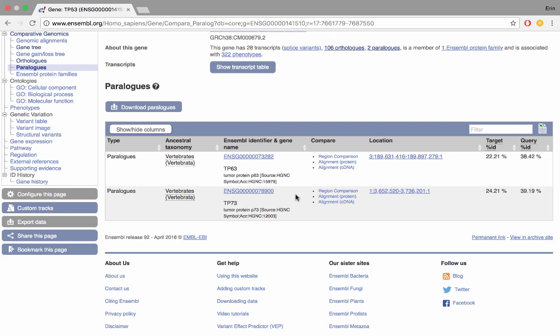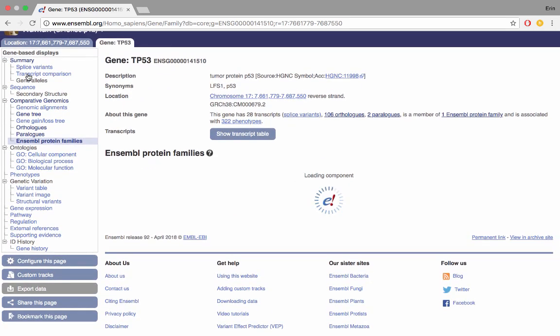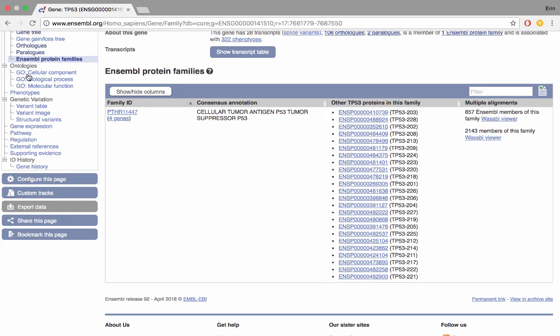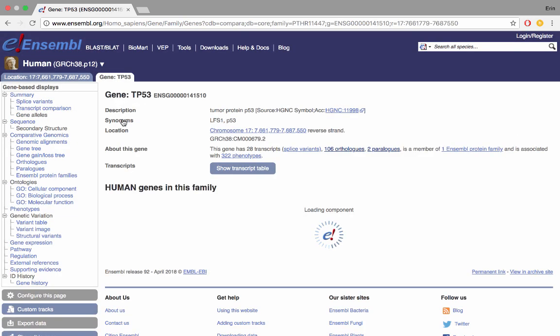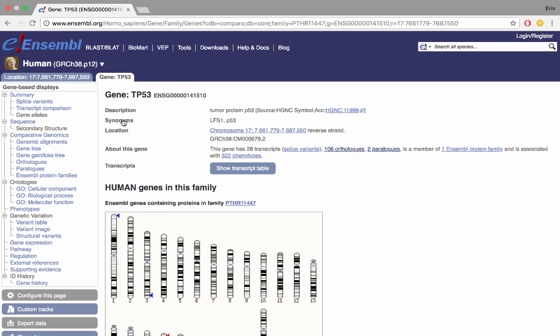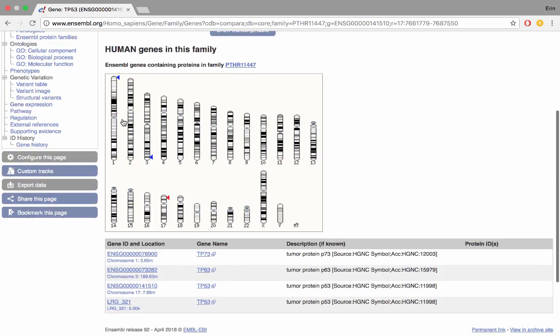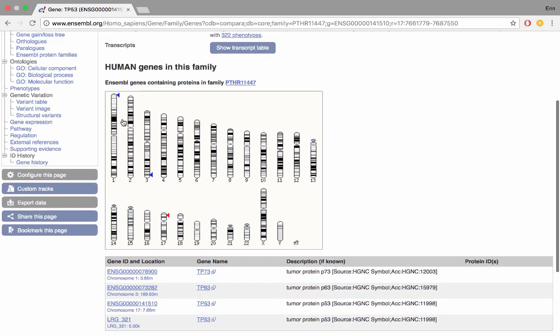Let's quickly look at protein families in which we'll see some similar information. Now we're on the protein family page. You can see the Panther ID here indicating there are four genes included in this group. We have a consensus annotation of a cellular tumor antigen and a list of all the other proteins that are present in this family. If we click on four genes here we'll be able to see all of the genes within this family. This shows us the location of these genes across the genome and also a list at the bottom here. We can see the paralogs TP63 and 73 that we saw in the paralog page as well.